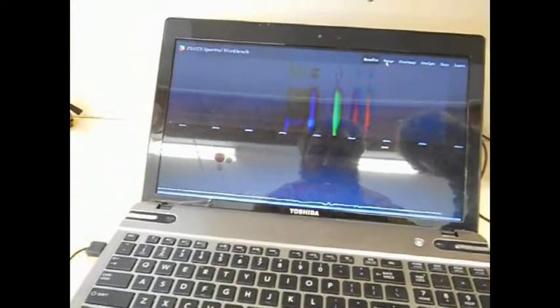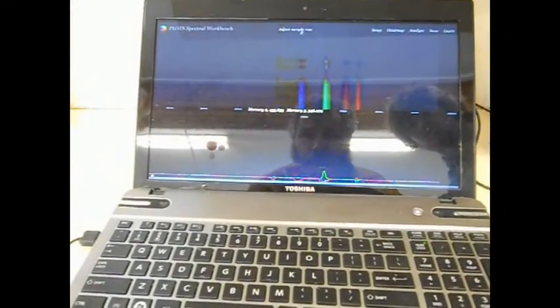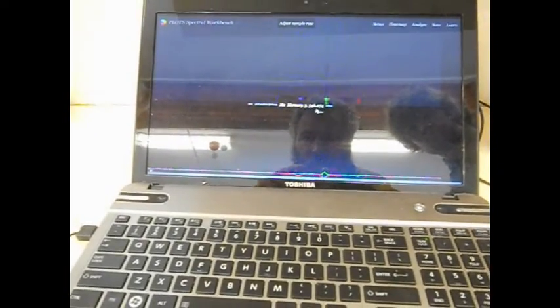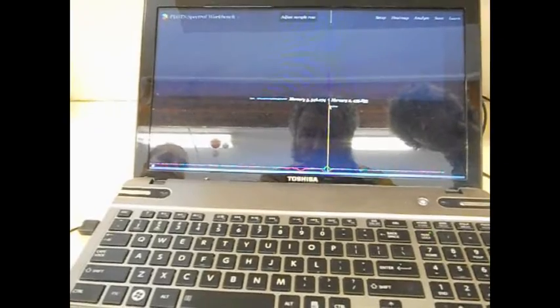Going into the setup, we can adjust the Mercury 2 line, which is that line there, and the Mercury 1 line, which is that green line there.